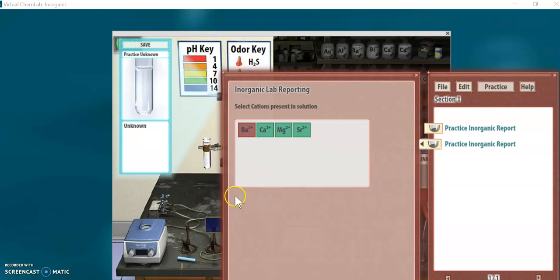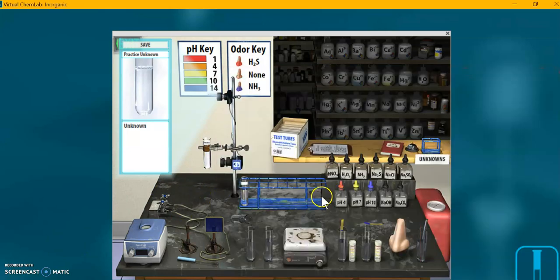So I'm done. I'm going to clear that out of the way. I can clear the lab by clicking the red waste can. And as soon as I do that, I see I've got another. This just appeared there magically. I've got another unknown practice unknown that is.